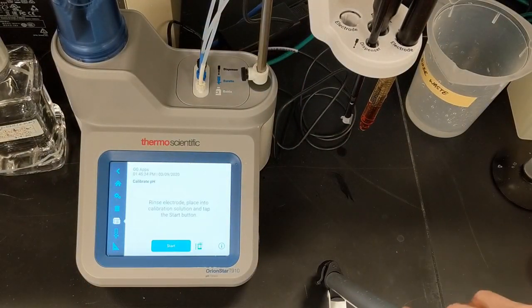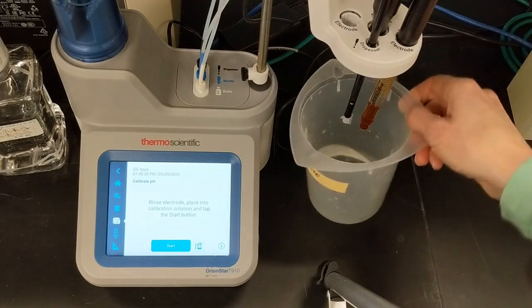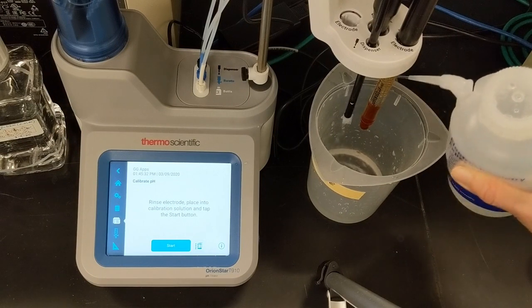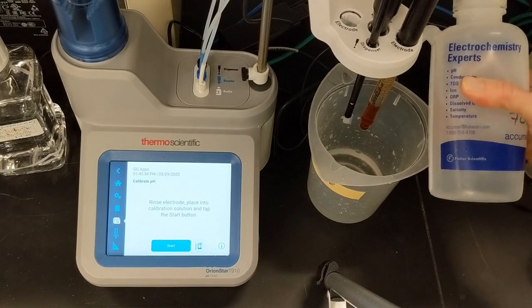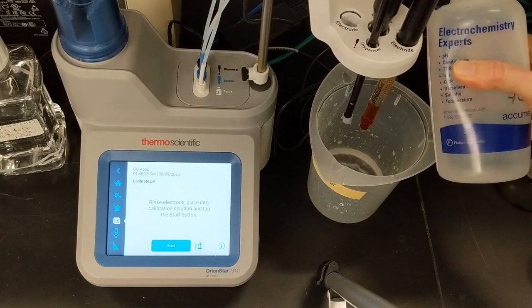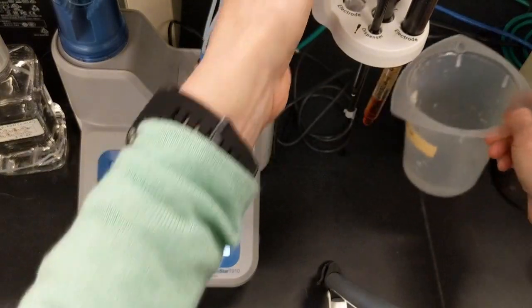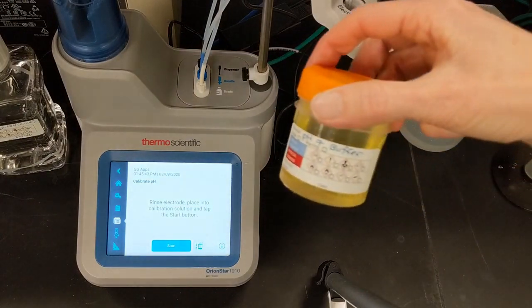Between calibration buffers, I'll be sure to rinse everything — the electrode, the ATC, the stirrer — with reagent-grade water to avoid carryover. I'll continue the calibration with the Orion pH 7 buffer, which I've poured fresh today.